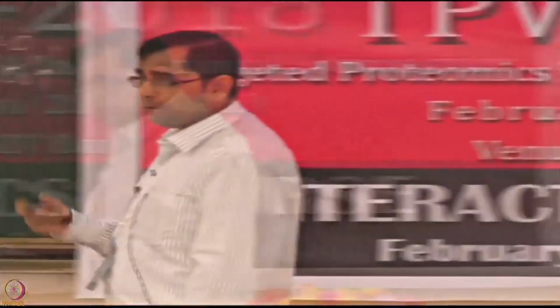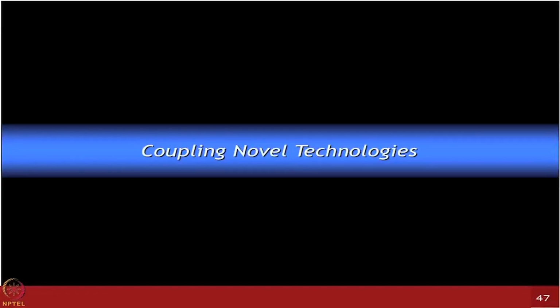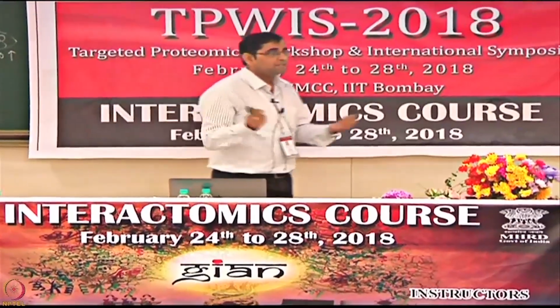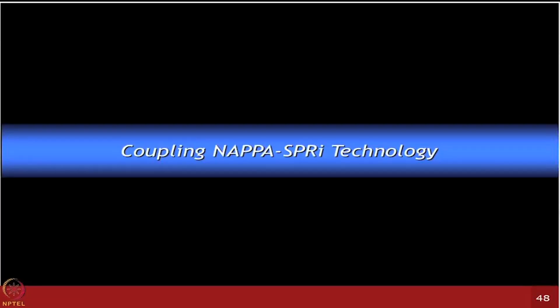All right, so over the period, what you would have realized from the various lectures given by Josh is that there is so much need for integration and development of new technologies, and that's where coupling different existing platforms becomes very crucial. In Josh's lab, we thought a couple of years ago, and many people are still working on developing those technologies, of coupling NAPPA technology with SPR imaging based platforms.